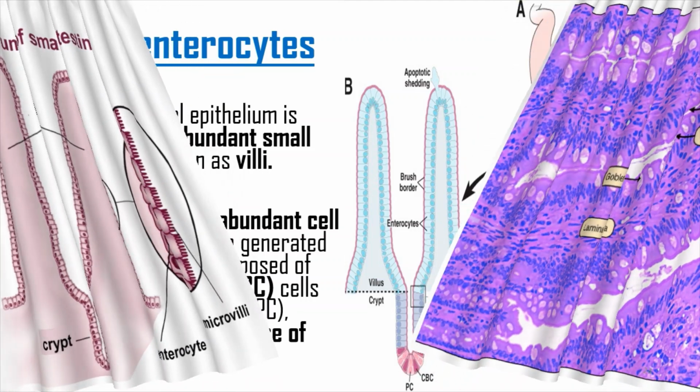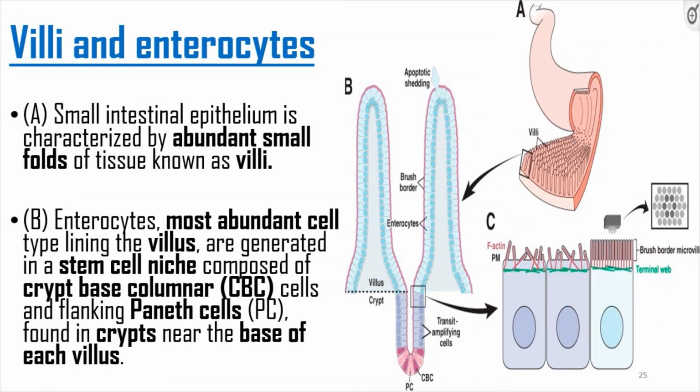This is the same thing I've been talking about. Show the microvilli, and then draw the simple columnar cells. Remember, this lab is about showing the epithelial cells. So the most important thing is showing the simple columnar cells with microvilli.